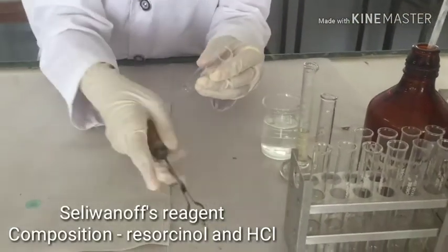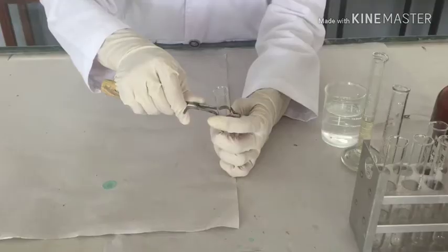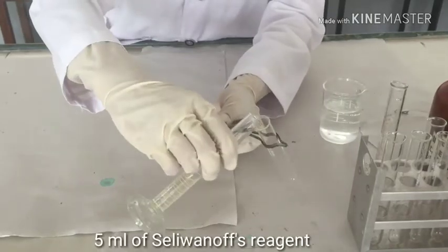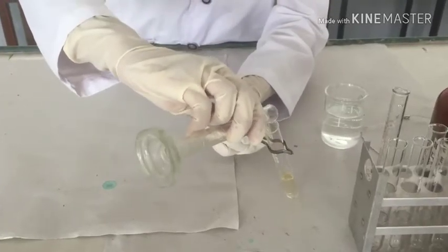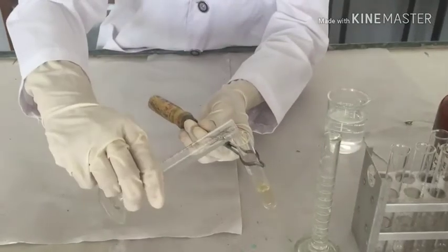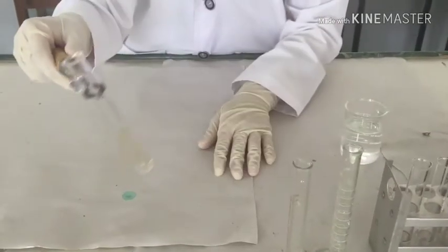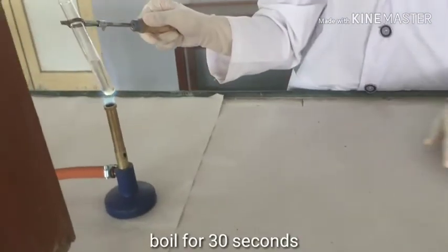Take a test tube and hold it with a test tube holder. Add 5 ml of Seliminov's reagent. Add 1 ml of sample. Mix the contents well and boil it for approximately 30 seconds.